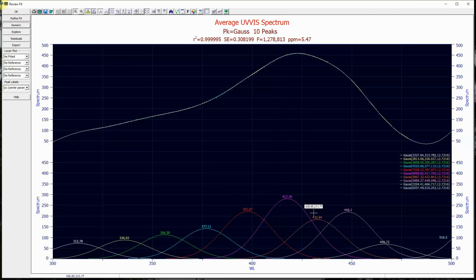We saw where the changes in the ratios of the components made it much more difficult to use a single wavelength out in the UV and the lower visible band. Now, our rule of thumb is to set the X wavelength spacing when you do your modeling to about 1/2 of the Gaussian standard deviation when you do this type of multiple Gaussian fit, and you optimize to get the highest F statistic with the different potential counts of Gaussians. In this particular case, half would be about 6 nanometers.